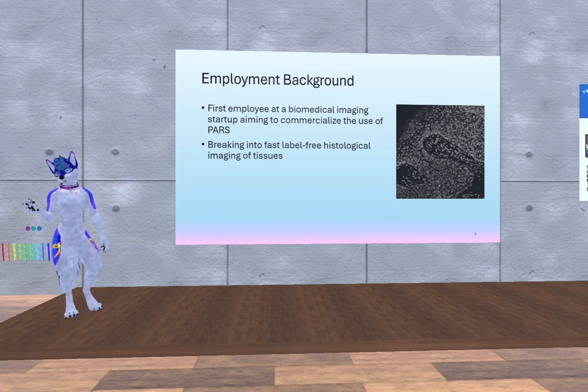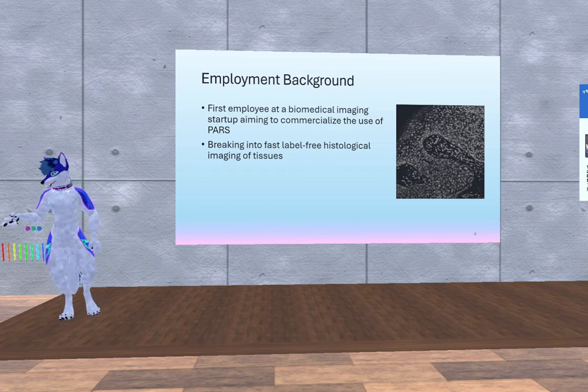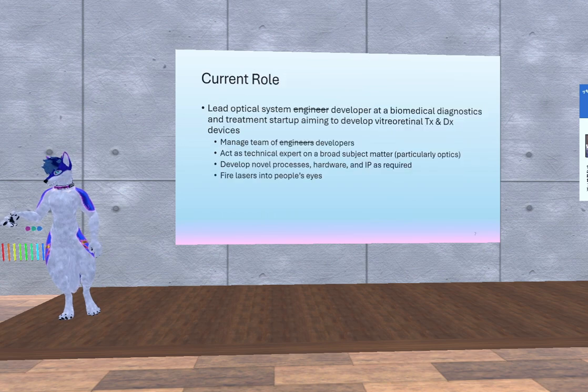I'm like, oh right, videos won't play. That's right. Well, the right thing is a video, just showing some different contrasts that we're picking up. Here we're primarily looking at doing label-free histology. So these are taken essentially of just unstained pieces of tissue and using absorption contrast to get at that cellular structure.